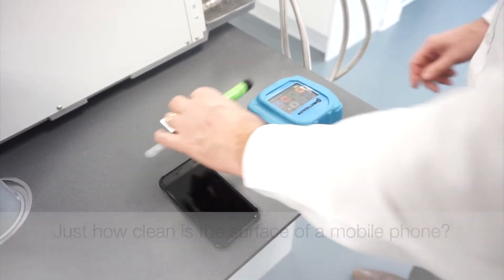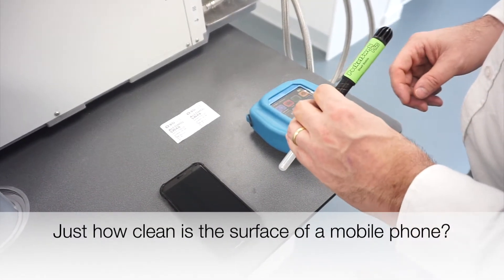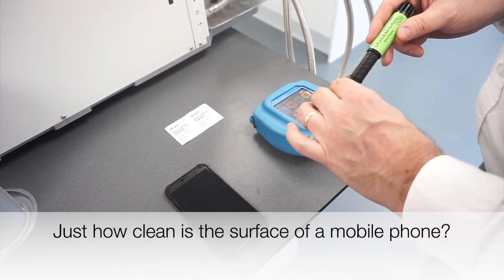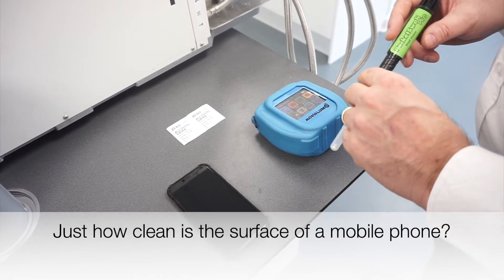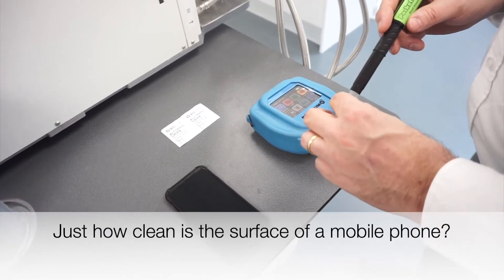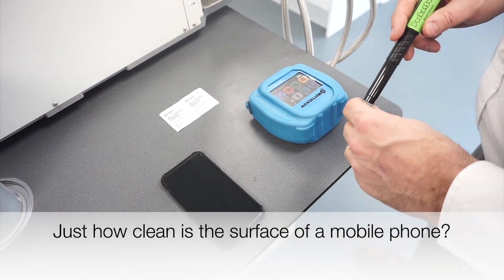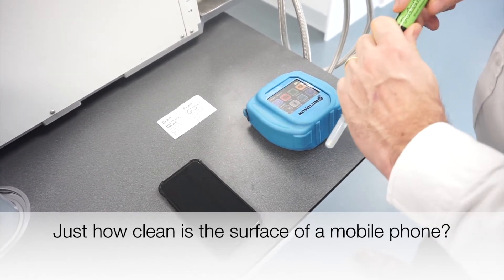Hi, today we've been working on some internal training on Charm's Pocket Swab system, which is a cleaning verification system for food production areas. But to verify it and to demonstrate it, we've been using a mobile phone to see how clean you can get.